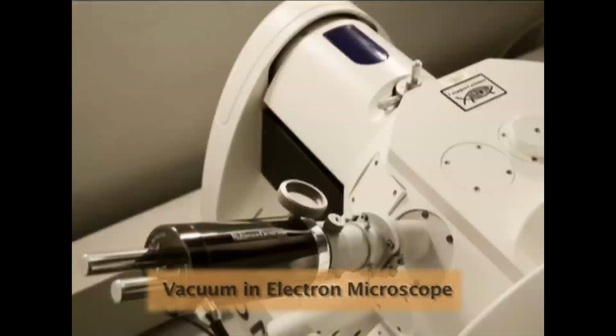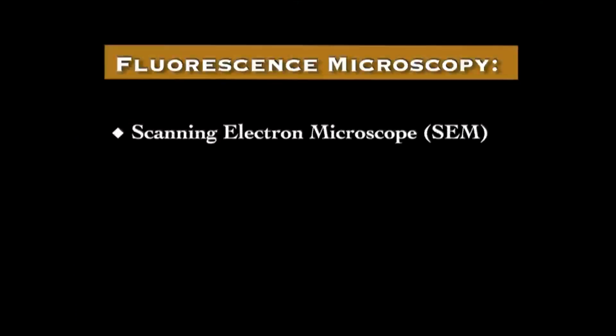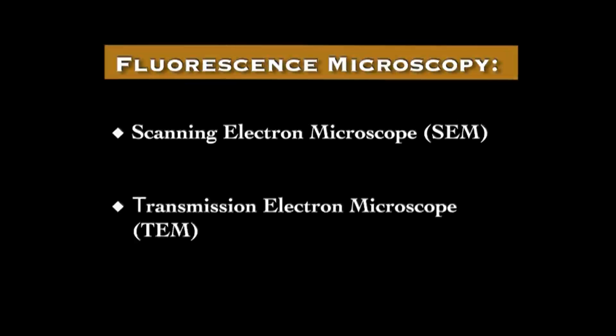Another aspect of the electron microscope is that high vacuum is maintained within that system. The sole reason for using vacuum is that the electrons will interact with air particles and might get deviated. To prevent this, we keep vacuum. Now, coming to the two major types of electron microscope, one is the scanning electron microscope and the other is the transmission electron microscope or TEM.